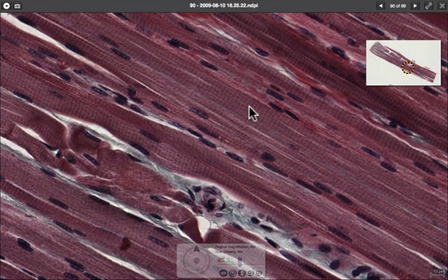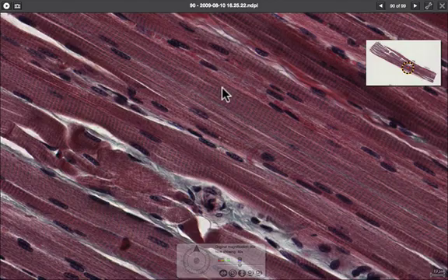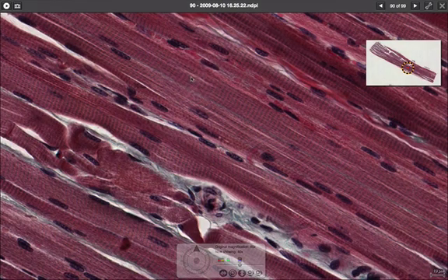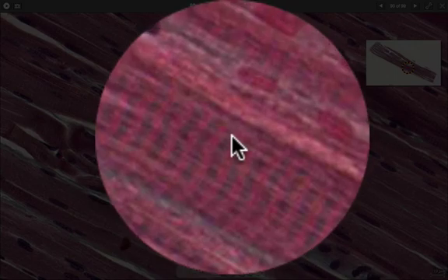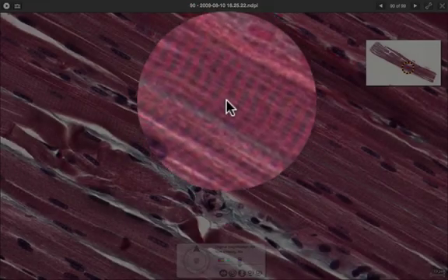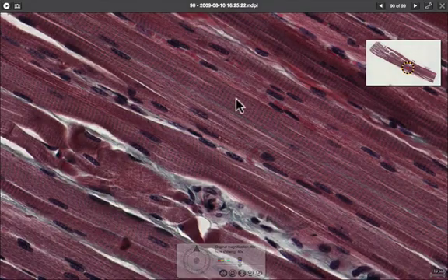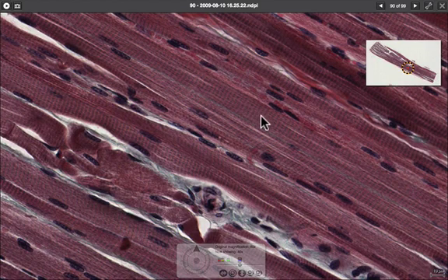Looking at the cell itself, you can see that it's stripy — this is called striated muscle. These striations are there because of the overlap of the thick and thin actin and myosin filaments, which cause contraction. The sliding of these filaments over each other causes the muscle to contract, and as they come apart again the muscle relaxes.